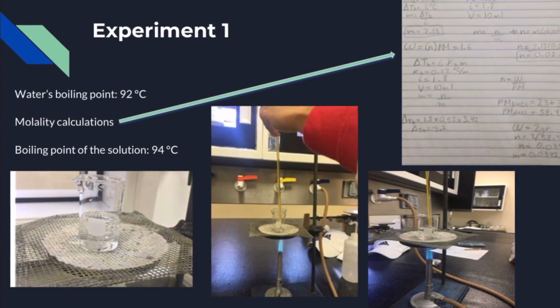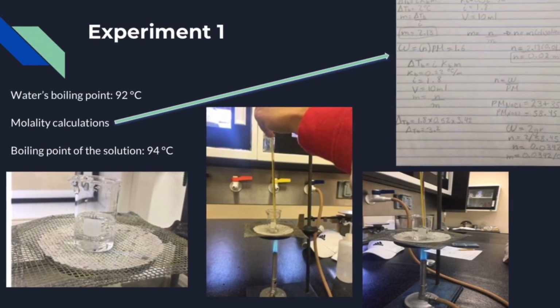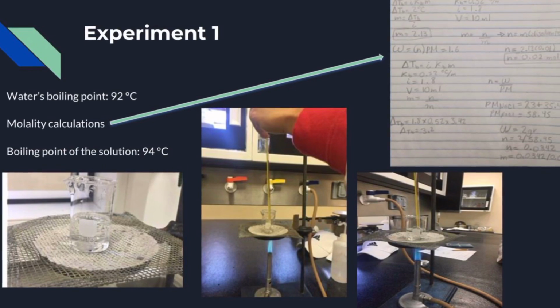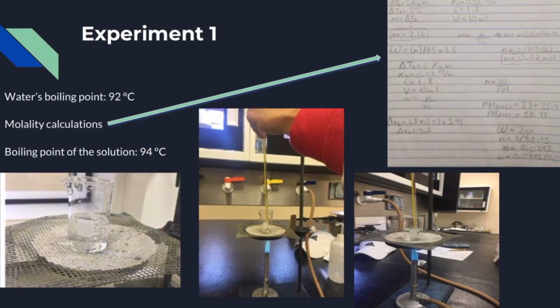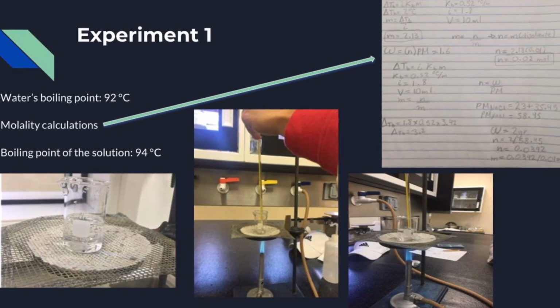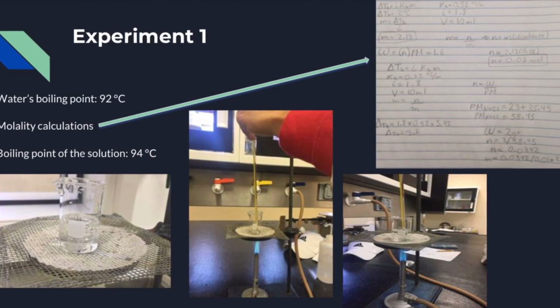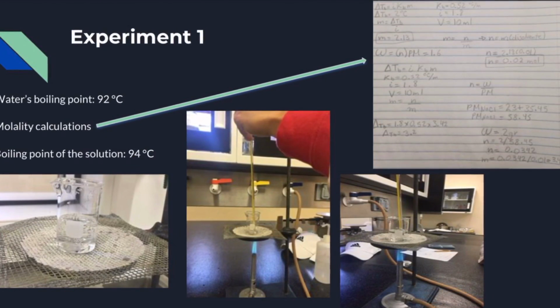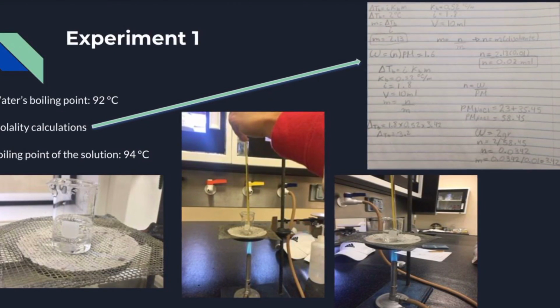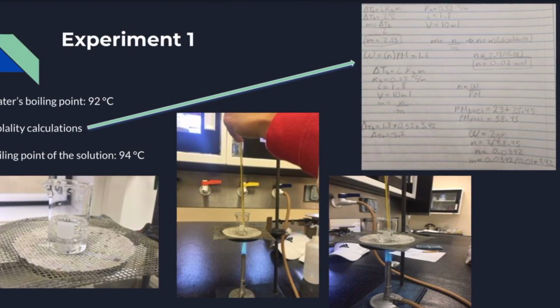The first experiment was about increasing the boiling point. First, we did some molality calculations, knowing that the experimental Van't Hoff coefficient for sodium chloride is 1.8. Then after that, we measured the boiling point of simple water, which was 92 degrees. Then we added a molal solution to increase its boiling point, resulting in 94 degrees.